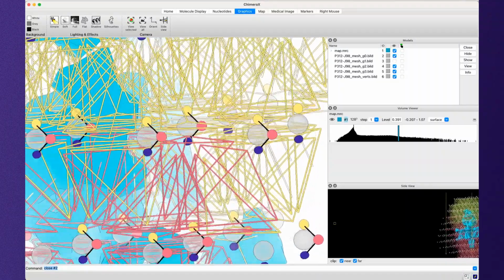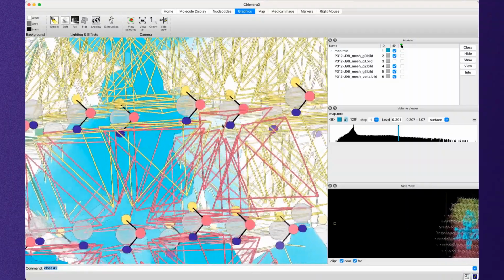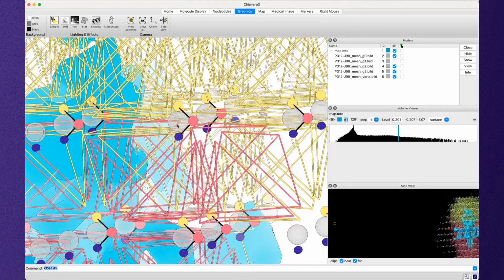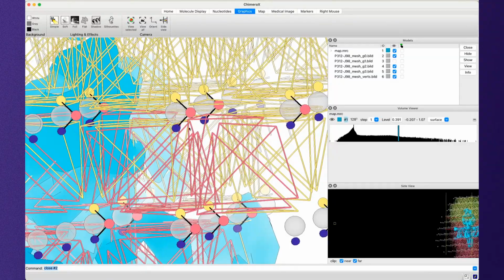And so if we look here, we can see two important things. First is that I've marked these vertices with the colors, right? Each of the yellow, pink, and blue meshes have a copy of this vertex. But they're connected here because yellow is fused to pink and blue is fused to pink. And so if we ever move this vertex, we have to move all three meshes that use this vertex. That is the really critical thing that we're doing when we perform these fusions.